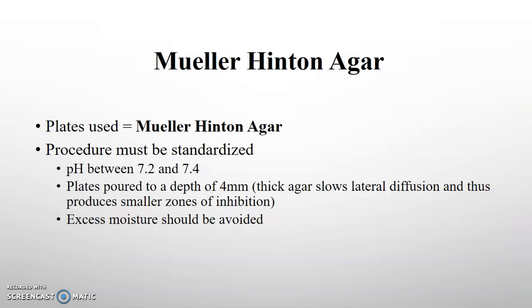So we will get to the chart in just one second, but before we get to that, just a little bit about that Mueller-Hinton agar plate again. You do need to remember that that is a specific type of plate that is used, as it'll come up in your lab report. This Mueller-Hinton agar plate is very standardized, so it's made professionally, and we do kind of want it to be made in a very specific way.